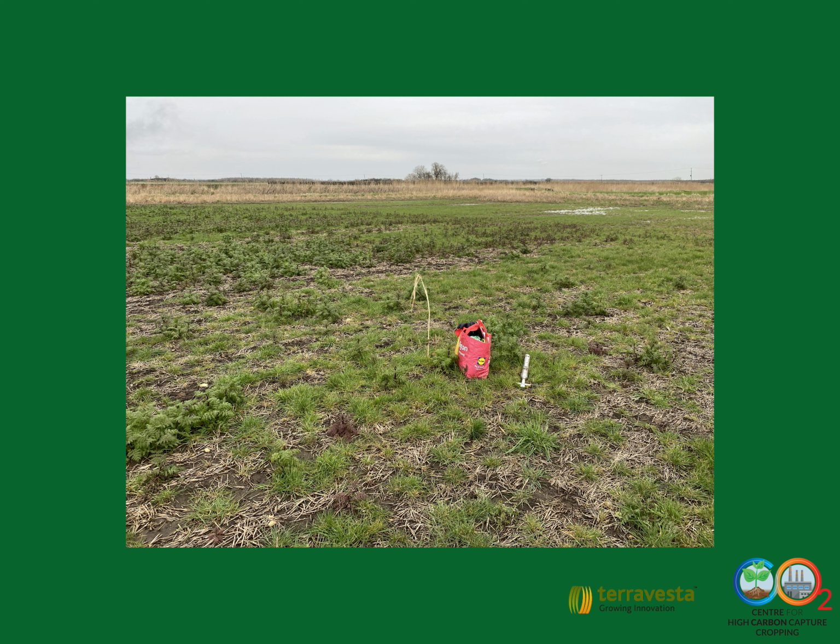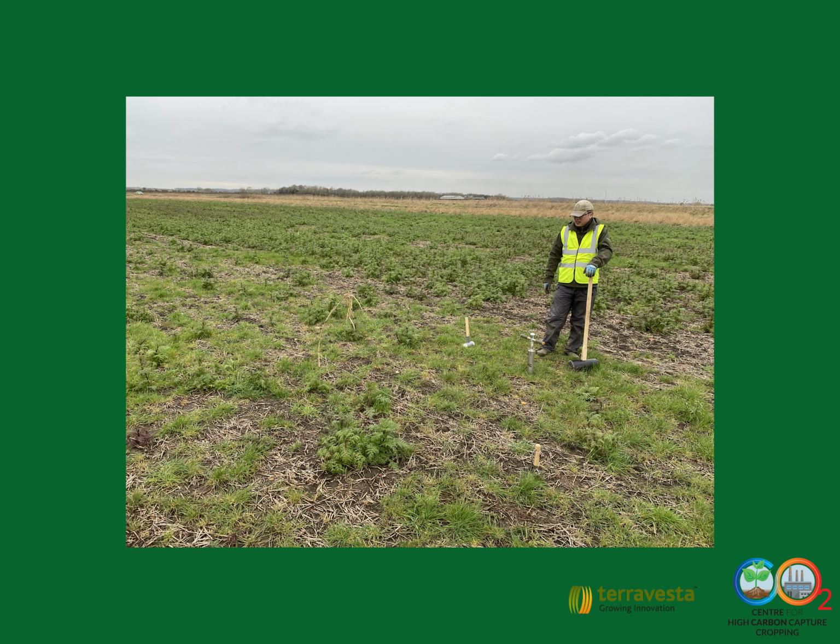For each of the plots, we found it useful to mark the central point with a stick to gauge our whereabouts within each plot. This could then be used to attach the 5 metre length of string to map the perimeter of each plot, so we weren't sampling outside of it.